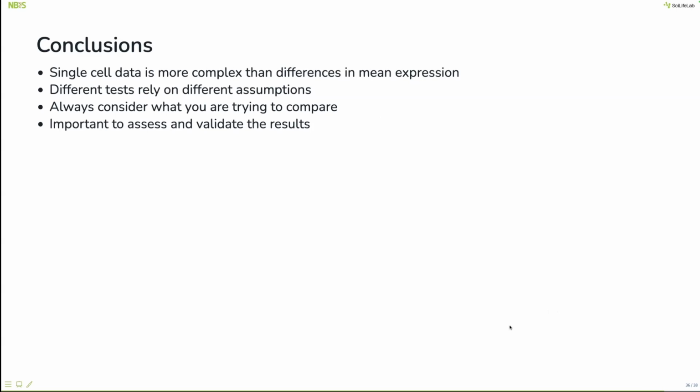Otherwise, also divide them up so that there's not one batch effect in your experimental groups. But if this is the design you have to work with, it is important to consider that it might be an effect that you see. If the batch is the same as your experimental group, it will be hard to say for sure that it is biological and not a batch.